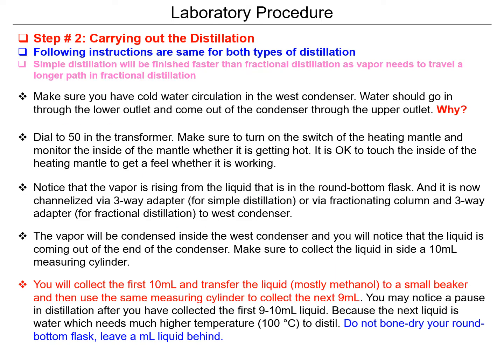So the next step is carrying out the distillation, right? The instructions are pretty much the same for both types of distillation. The only difference is how long it takes, right? The fractional distillation takes longer because you have to go over a longer tube.